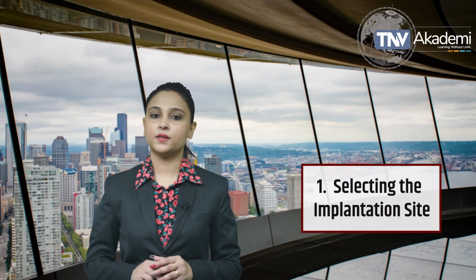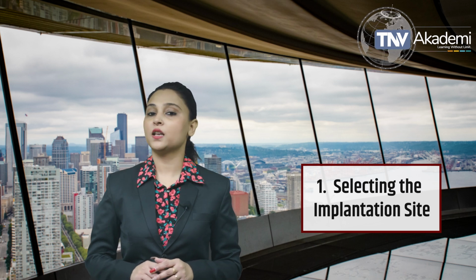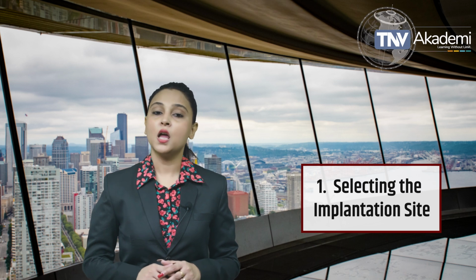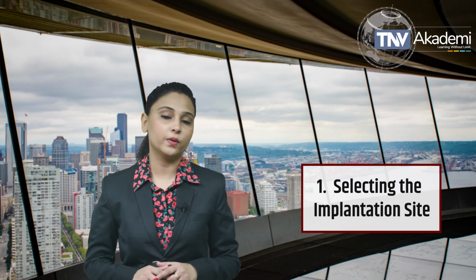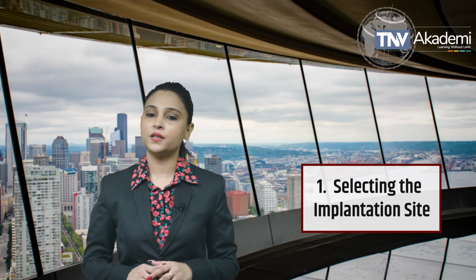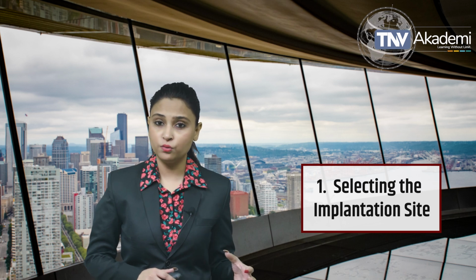Steps in implantation testing. Selecting the implantation site. The testing process begins by selecting the appropriate implantation site in the test animal. This location should closely replicate the human implantation site to provide relevant data. For example, a material intended for bone contact would be tested by implanting it in or near bone tissue in the animal model.